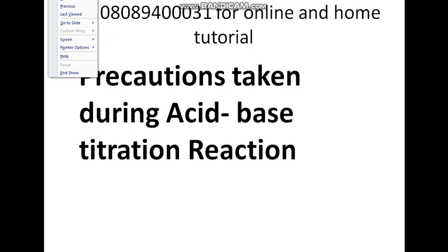During the titration reaction of strong base with weak acid, the pH of the solution changes between 7 and 11. This pH range covers the pH range for phenolphthalein indicator solution. Hence, phenolphthalein is the only suitable indicator for titrating strong base with weak acid.